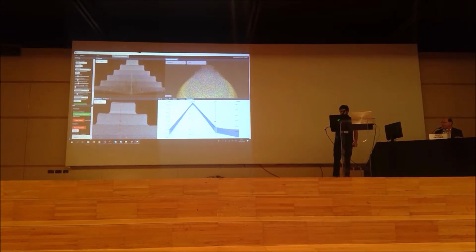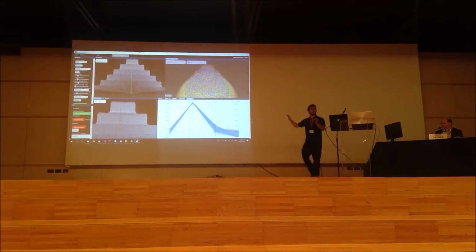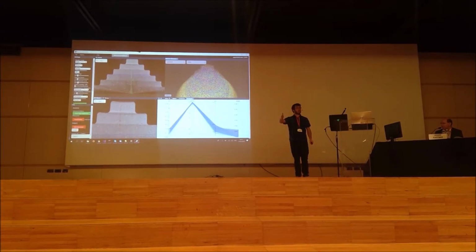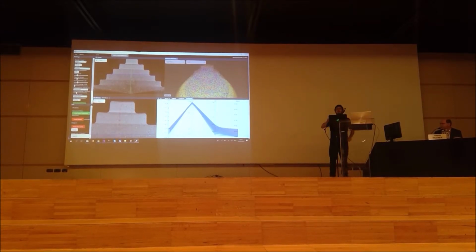So what we can do now is we can look for different parts. For example, we can filter out the background. For the algorithm, it's hard to decide if it's background or if it's a pore. So if we now remove the background and unwanted features, we can jump back into the algorithm and proceed.